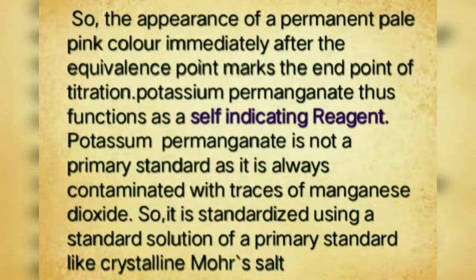So, the appearance of a permanent pale pink color immediately after the equivalence point marks the end point of titration. Potassium permanganate thus functions as a self-indicating reagent.